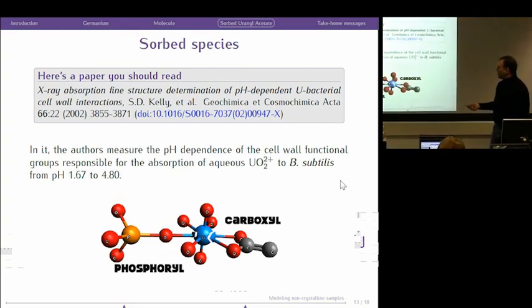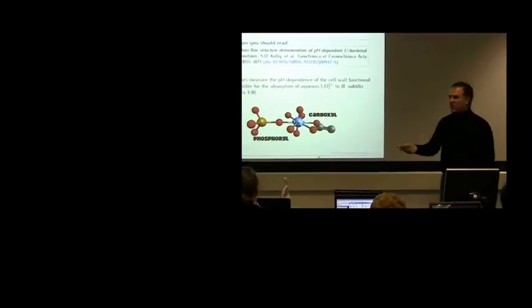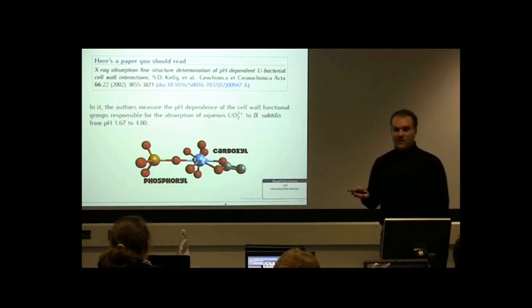And this kind of structure or this kind of structure are really the only binding options when you put this ion in the presence of biomass. The problem is that there's certainly no such thing as crystal data for this. I mean, this is a uranyl ion on goo, right, on stuff. And nobody knows what the structure of uranyl on goo is. That's just not something that you're going to find no matter how much time you spend on Google.